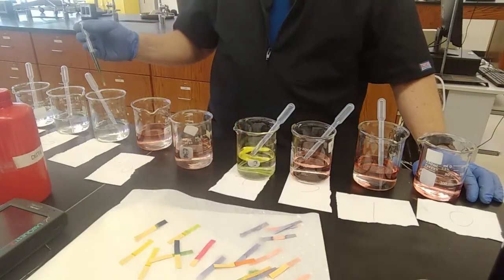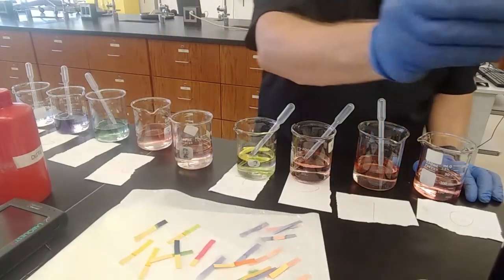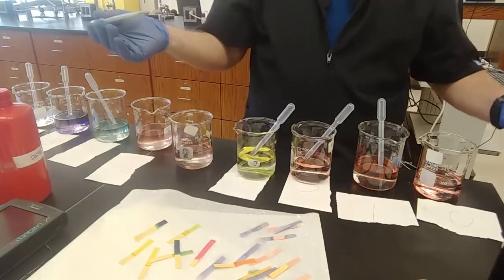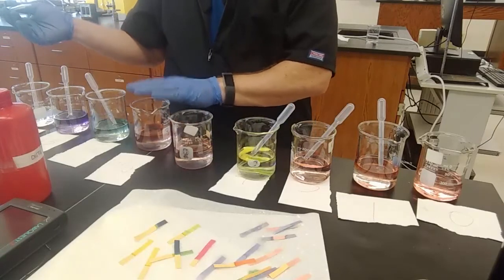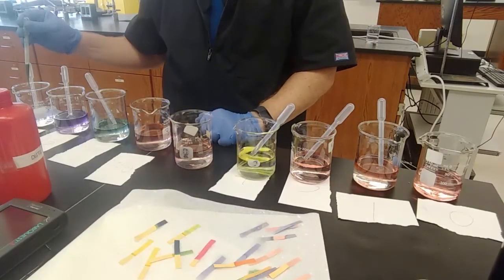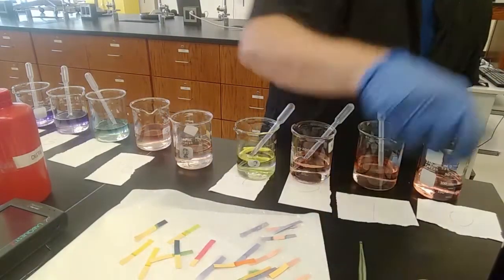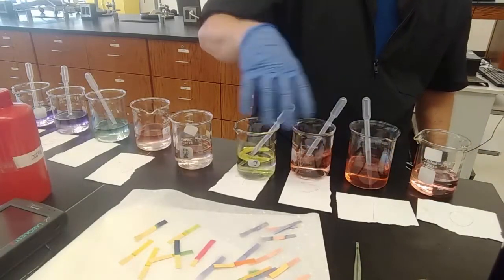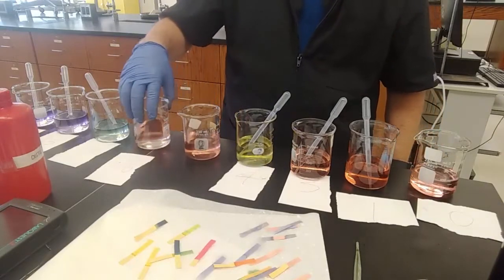This is going to be the only one that's out of order, I think, based on our previous experience. Number 10 we made from the base. 0 to 4 we made from the acid, and then the neutral was just the water by itself. So this 10 is a screw up because we started from the base and went down, but with very acidic water. Give each one a swirl. And I think you'll see colors that are very similar to what we were looking at on the strip.